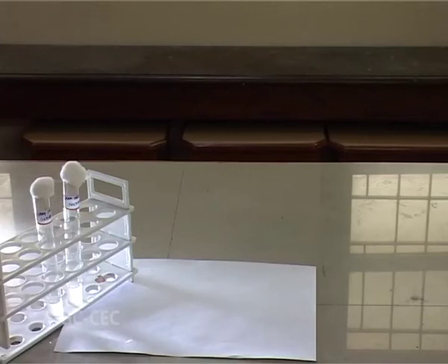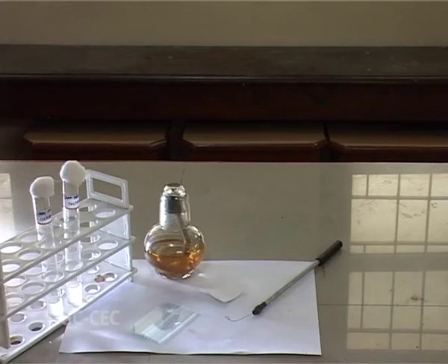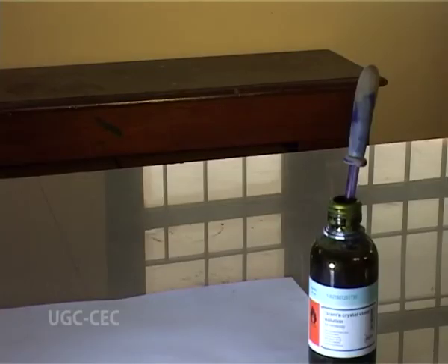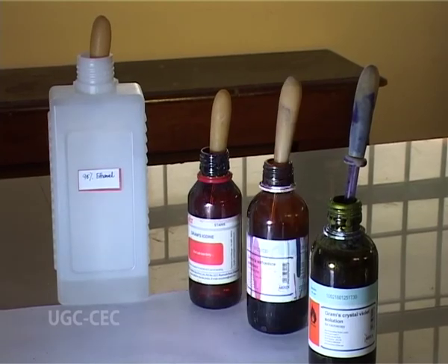We require one gram-positive culture and one gram-negative culture. In this case, Escherichia coli and Staphylococcus aureus. We require clean, grease-free slides, an inoculating loop, a spirit lamp, blotting paper to remove the excess water, and a microscope. Reagents required: crystal violet, gram's iodine, 95% ethanol, and safranin.